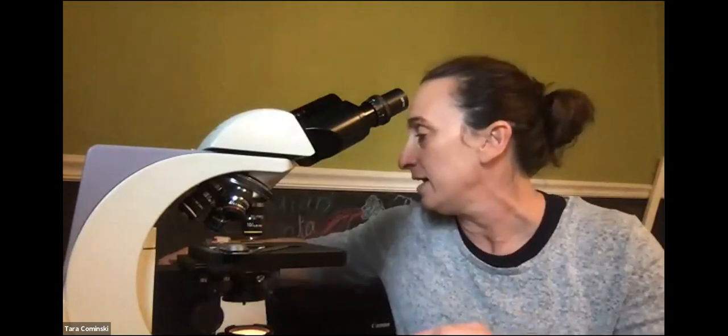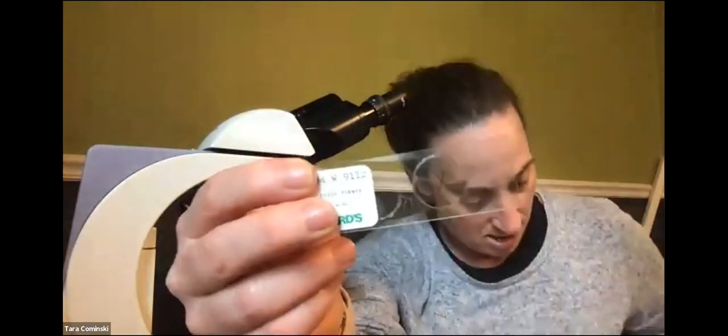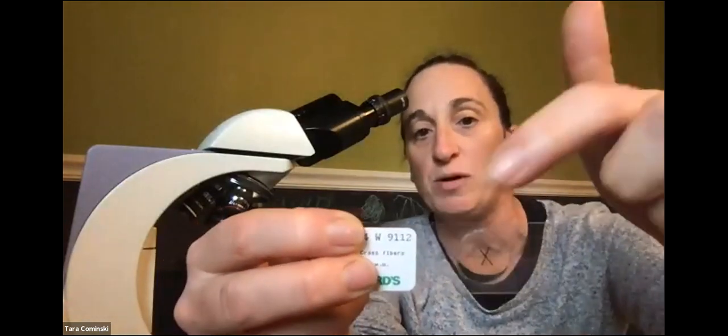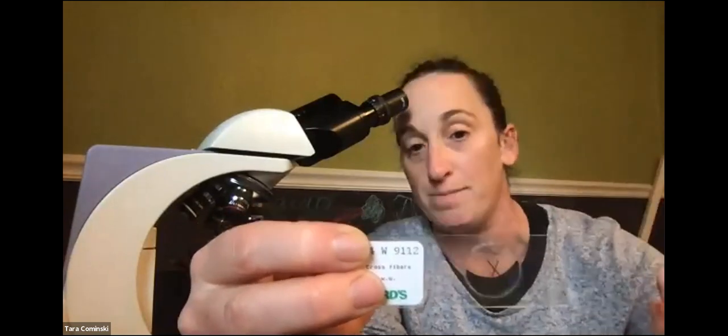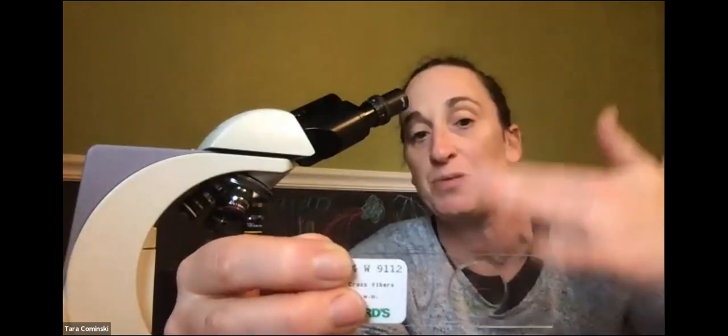What we're going to do is put in a slide that has 3 different colored threads, okay? Basically we're going to determine the order of these threads as we move through. You're going to determine which one is on top, which is in the middle, and which is on the bottom, and that's illustrating depth of field.